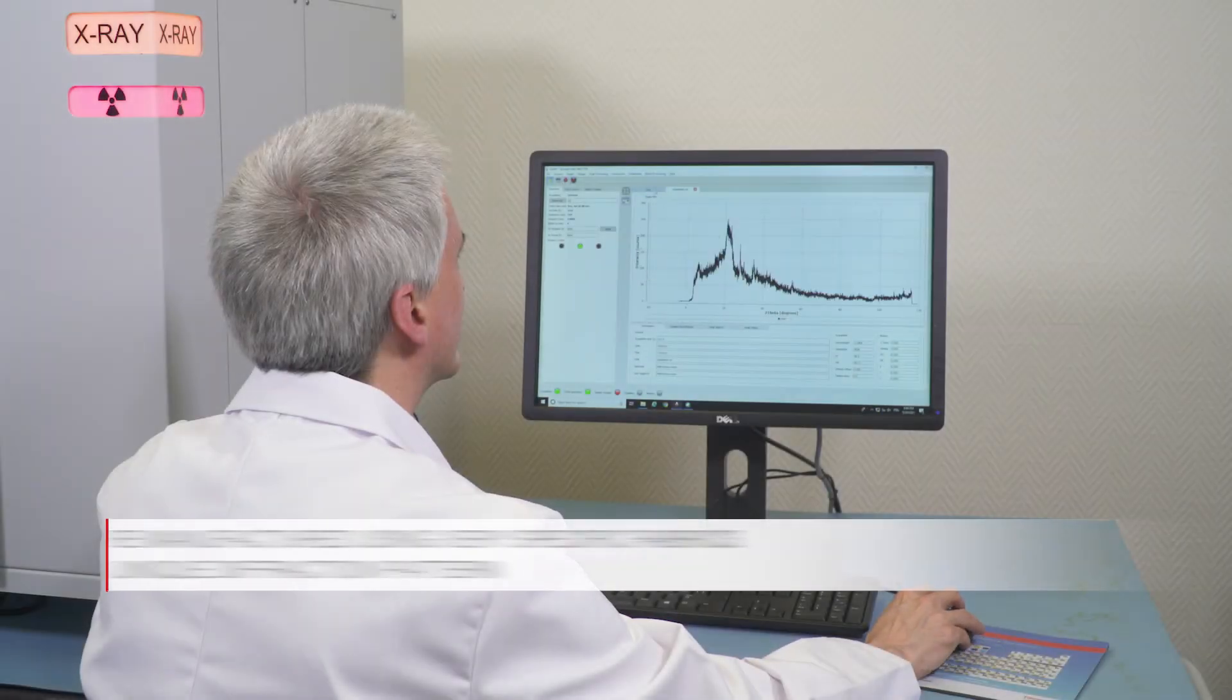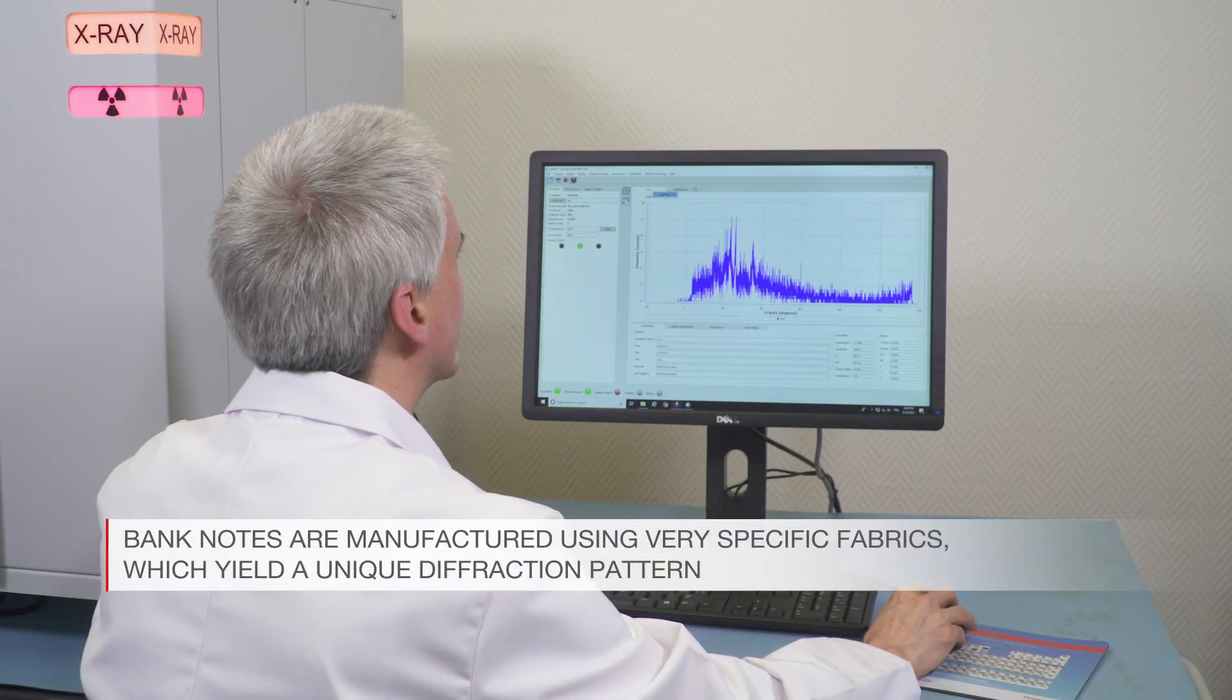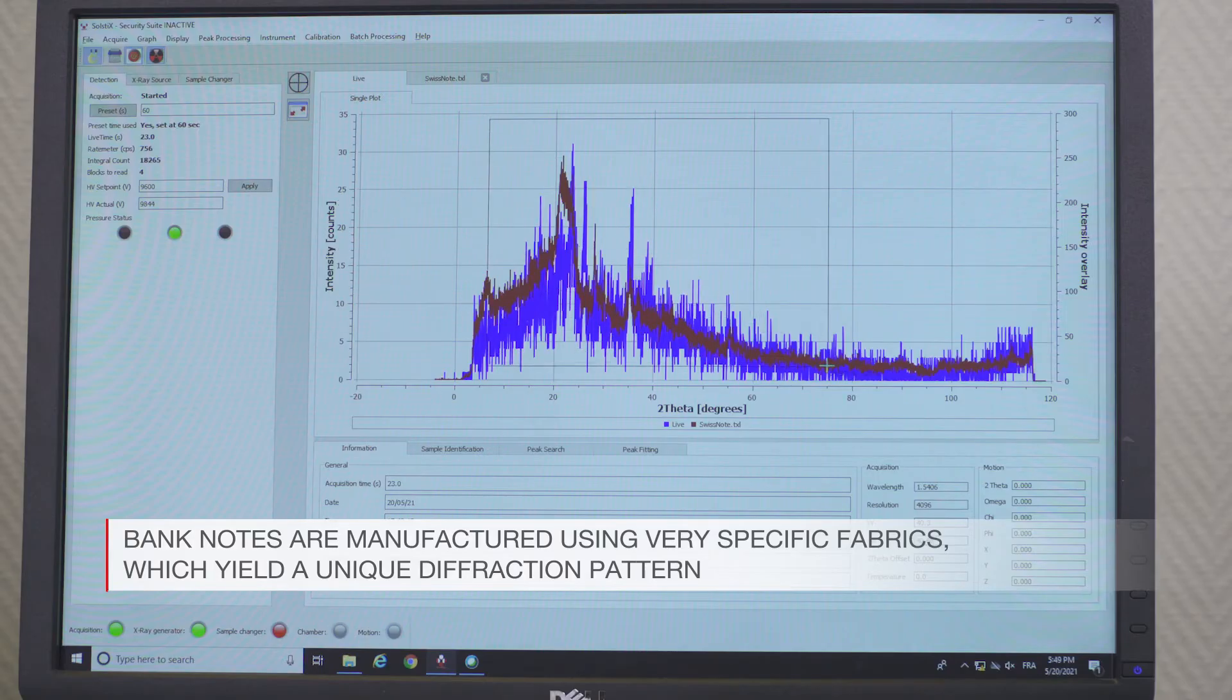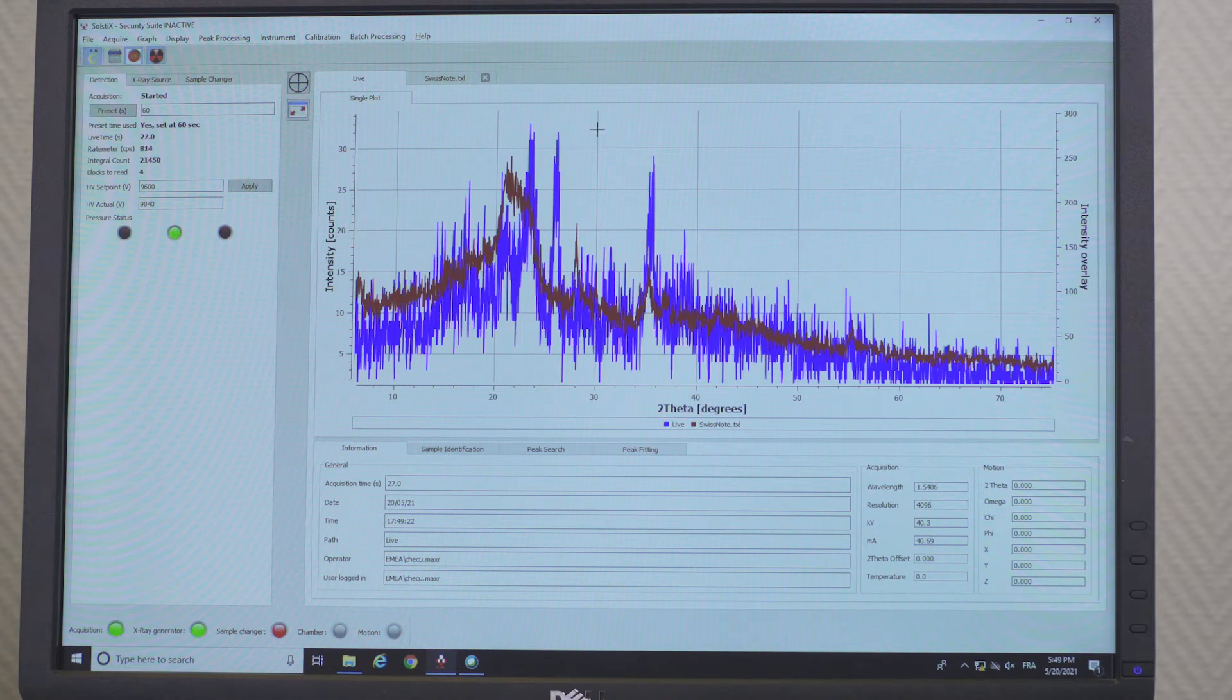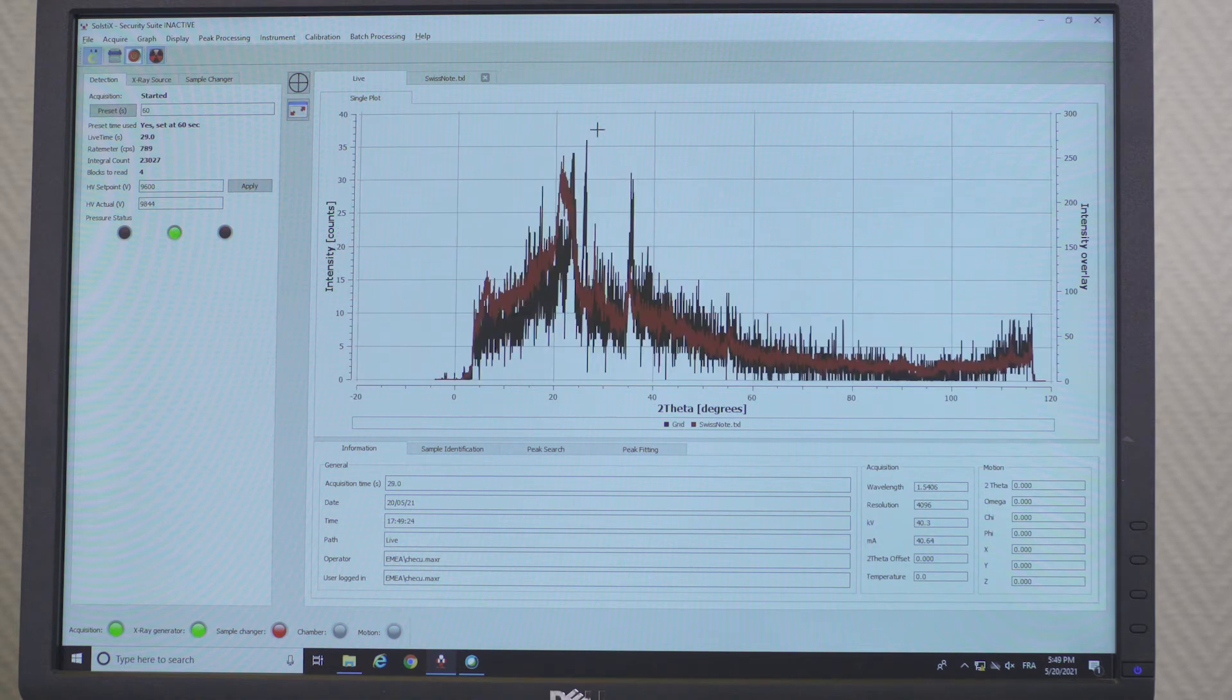Banknotes are manufactured using very specific fabrics of artificial or natural origin, which yields a unique diffraction pattern. Comparative analysis of real and counterfeit notes can be achieved within minutes.